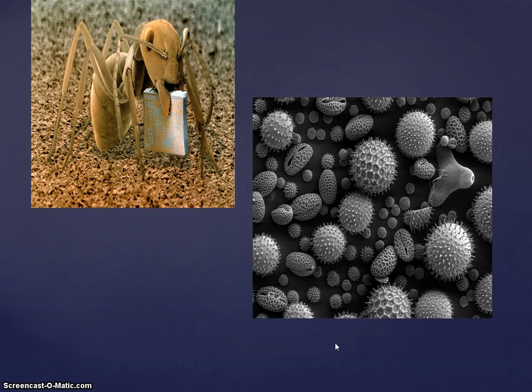If you look at them, they look like, what are they, aliens? Are they diseases, viruses? These are actually mixes of pollen grains. Now, when we say pollen grains, remember pollen is simply just the sex cells, the gametes of plants, of sexually reproducing plants, that they release, like pine trees release pollen. Many plants release them. These are the sperm. They fertilize the eggs of the plants. If you look at them, that's what they look like under the microscope.